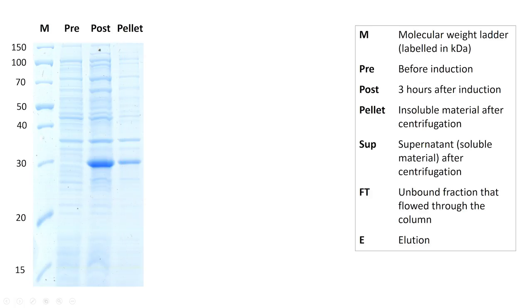The next lane is a sample from the pellet after lysis. The next lane shows the supernatant after lysing the cells. The lane after that is the flow-through, and this flow-through shows you everything that has gone straight through the column. The last lane here is the elution. This is a nice big band of elution of our protein at about 30 kilodaltons.